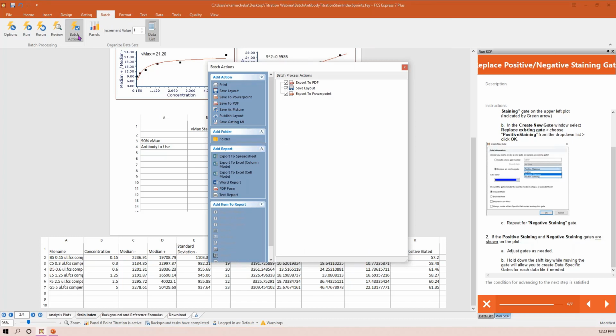Now this is completely customizable, as are all parts of this layout. So if you're liking parts of it and maybe want to change others, once you download this template, you have free reign to make it work for your workflow, your data analysis. We're going to export this out to a PDF. We're also going to save the layout, because it's important you keep your template separate from the actual layouts that you've got your information in. So we have created an element to do that in the save layout.